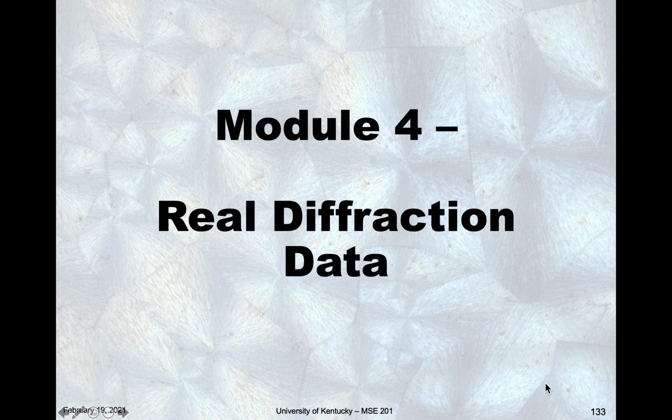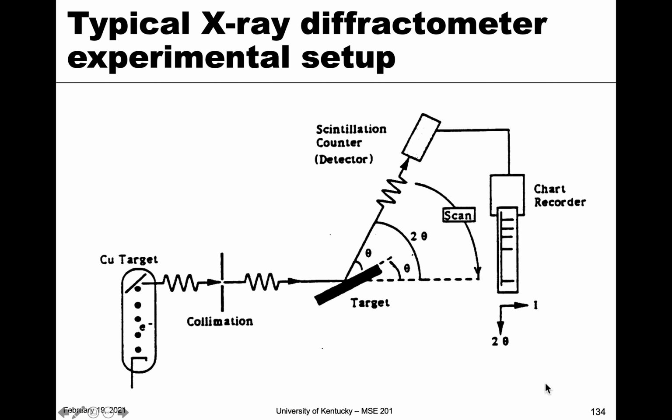So in this module, I want to take what we've just learned about Bragg's law and apply it and see what a real diffraction experiment looks like. So I want to show you the setup first. This is a pretty typical X-ray diffractometer, the actual experiment, the actual equipment. That's what we call it, diffractometer. This is the actual setup.